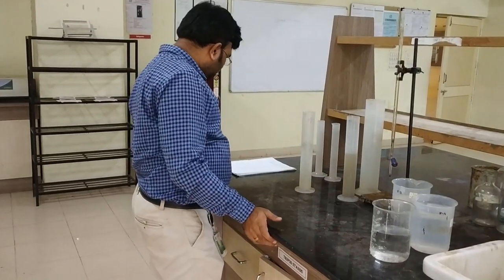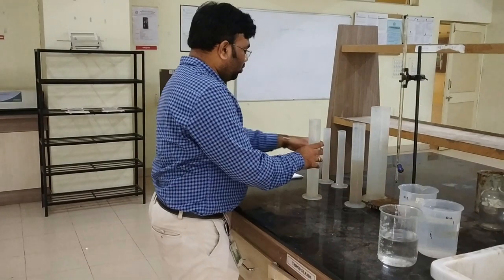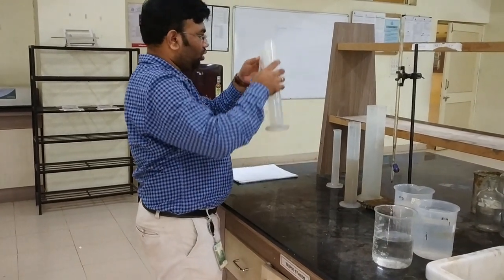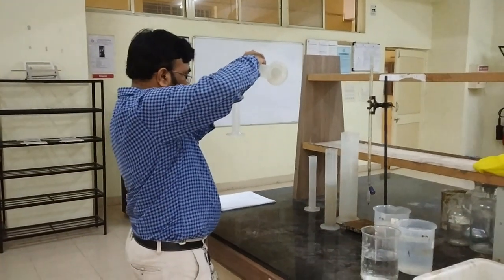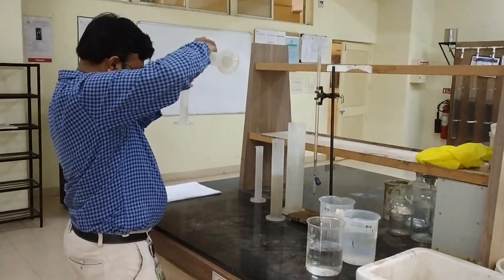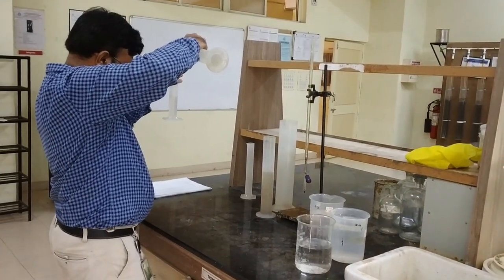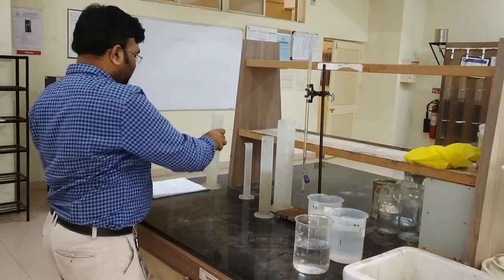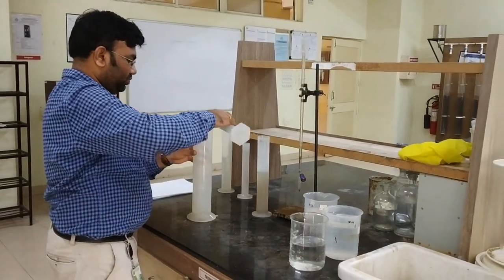The next step here is to extract 50 ml and then dilute it to 1000 ml. So we are going to extract 50 ml from this. Right, 50 ml, and then we are going to dilute it to 1000 ml.